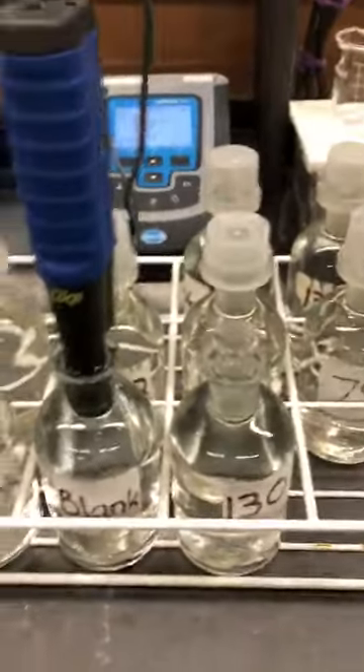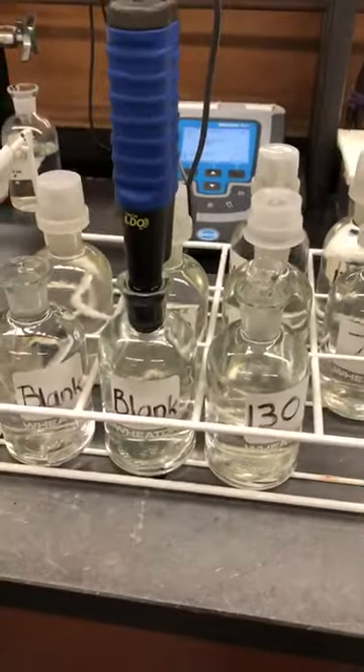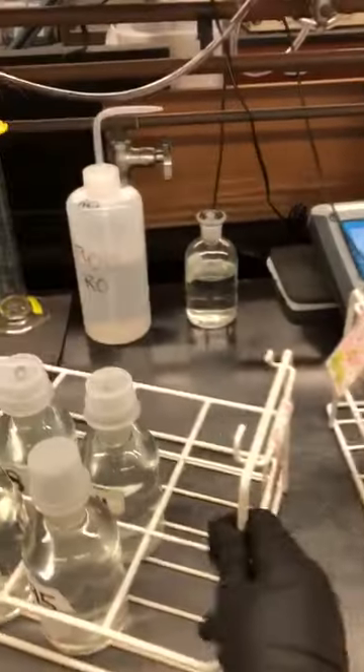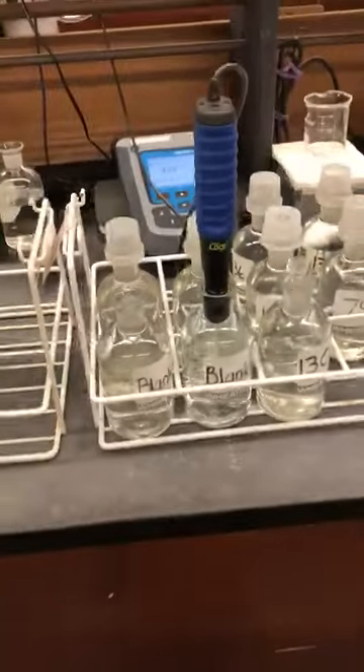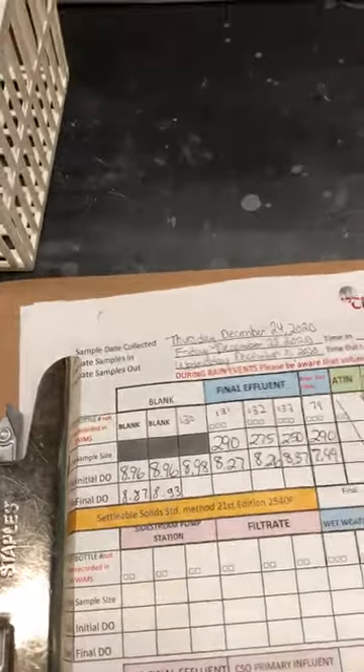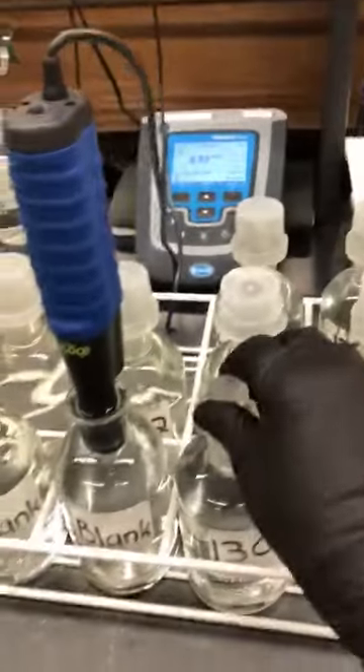There's a button, so it's reading another blank. We press read and wait for the next number. We continue the same way for all the bottles. This is reading after 5 days of BOD. The number is ready: 8.93. Let's continue with another bottle.